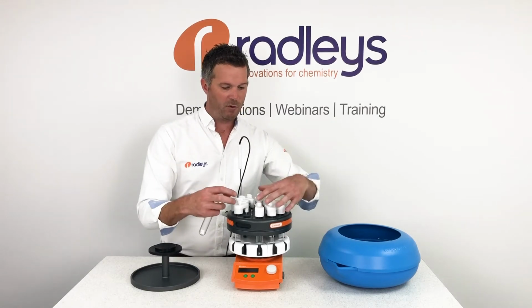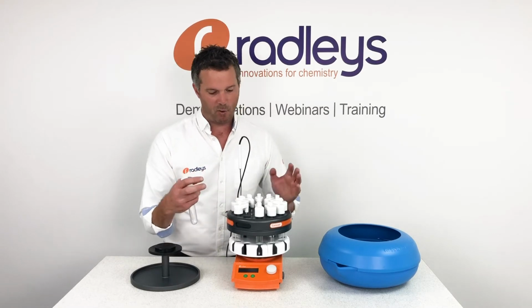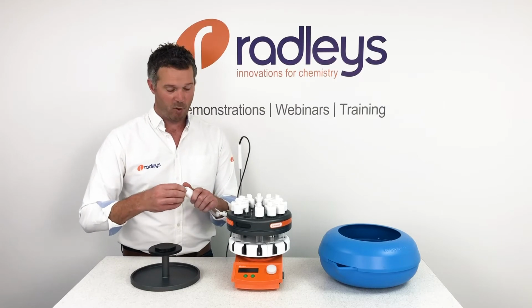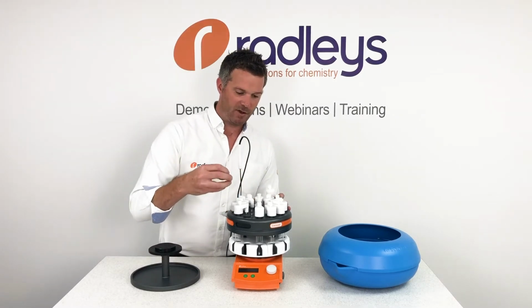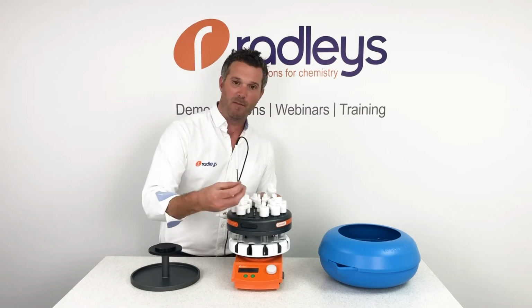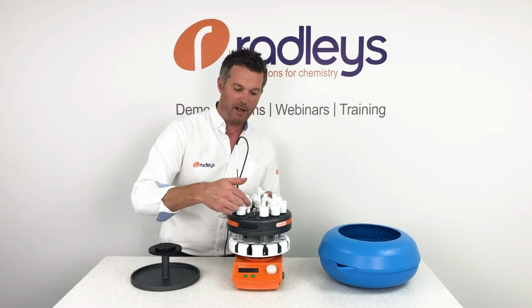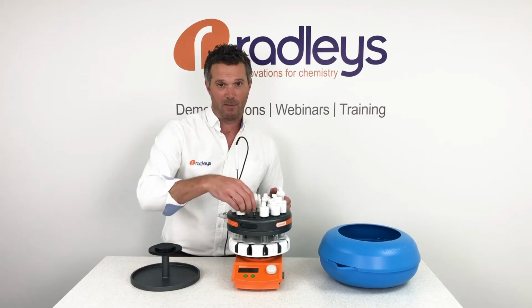In fact, a lot of people just use this for 1 or 2 positions. They don't set up all 12. They just think it's a convenient way of setting a small scale reaction up. If you are going to use it for just 1 or 2 reactions, the positions that you're not using, you just remove a septum from the cap, turn it upside down and use it to blank off the inert gas port, so you're not losing all your inert gas through the empty position.